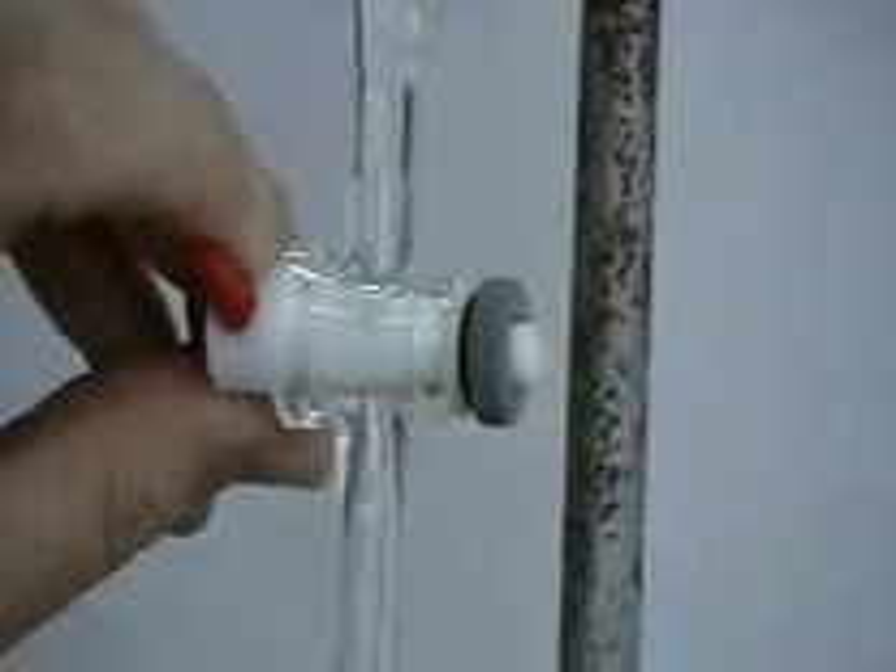Those two are effectively separated. That's how to separate two liquids with a separating funnel.